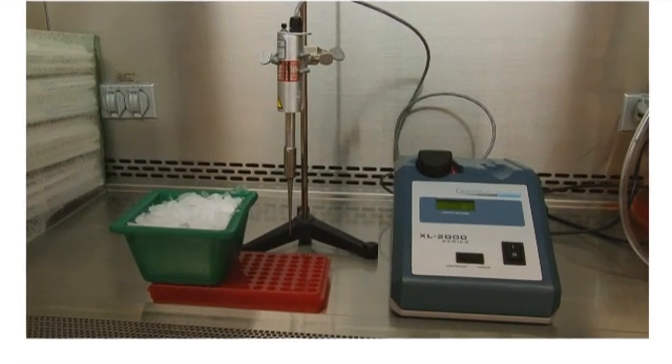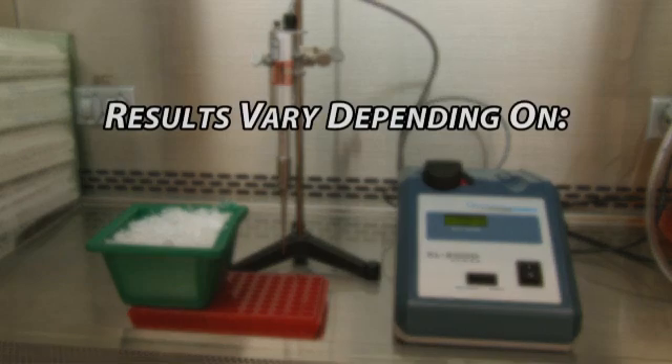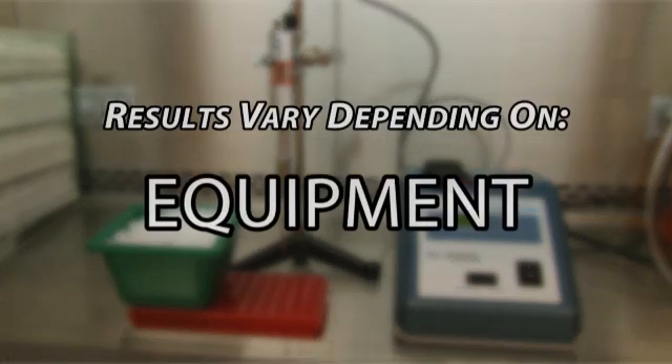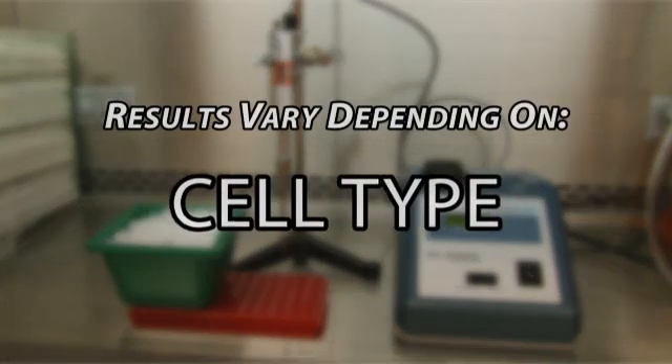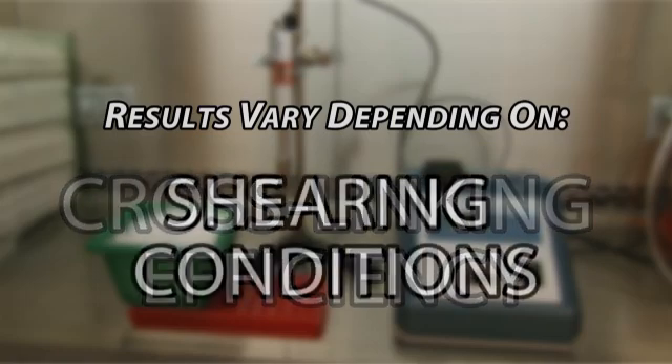The conditions for shearing must be empirically derived and optimized before proceeding to any of the following phases. Results vary depending on your equipment, cell type, cell density, cross-linking efficiency, and shearing conditions.